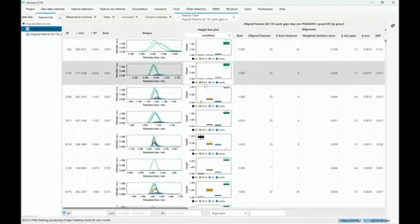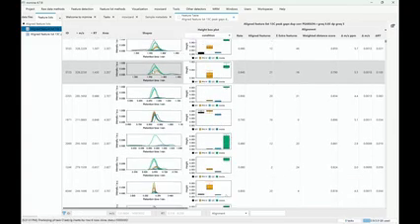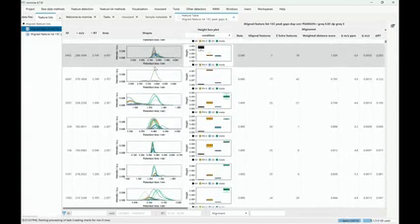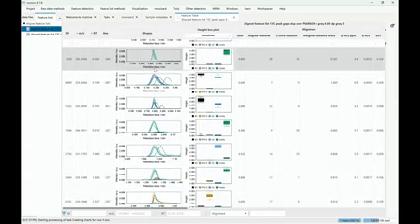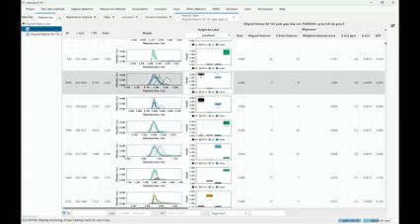And then in here, if I scroll through, we're going to see that there's a lot of green. Green is actually the media. So it was not really blanks. It was the media blanks. And of course, there's a lot of compounds in there. There's a lot of nutrients. There's a lot of small amino acids. And those are actually the ones that we detect here as, of course, first of all, being quite dominant first. If we go through, there's also going to be a lot of other compounds. So there's the black ones and the blue, which is then the QCs or the different strains of microbes.